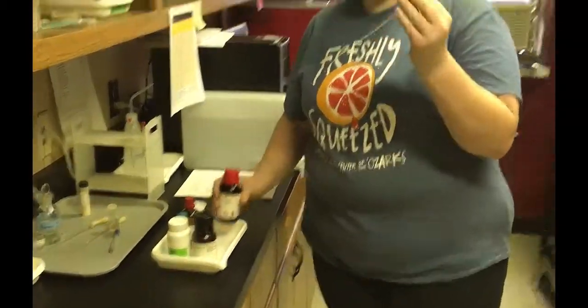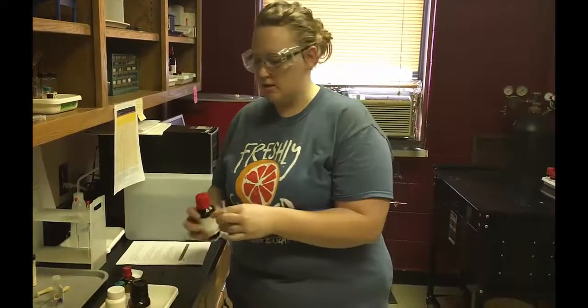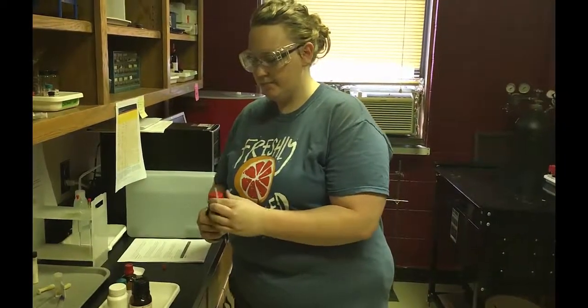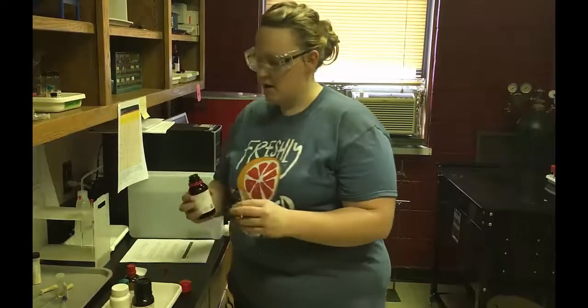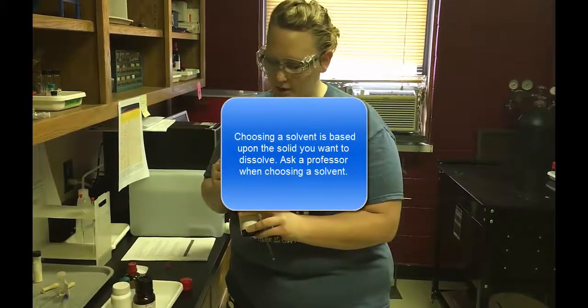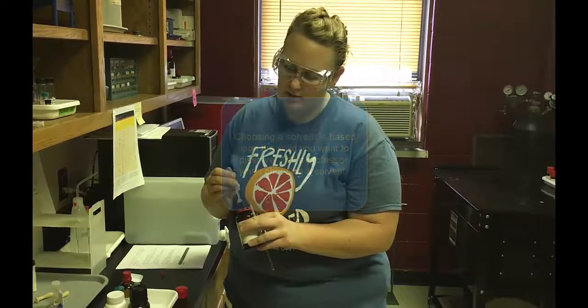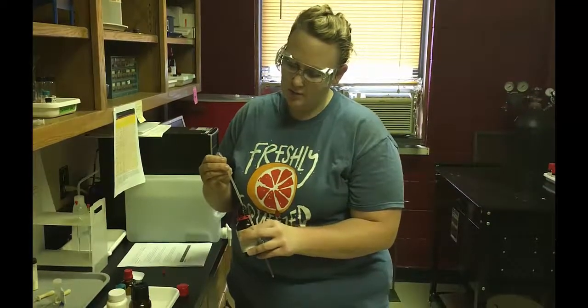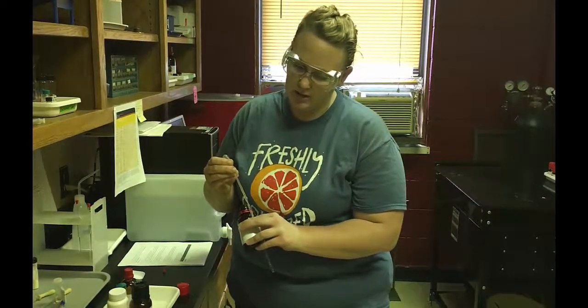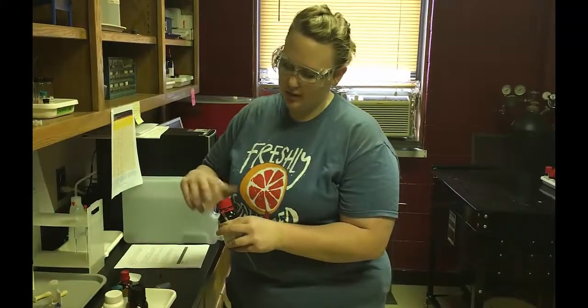Since this is a solid, the NMR machine will not run spectra on solids. It needs to be a liquid or solution. So I'm going to take a little bit of deuterated chloroform, because this will dissolve vanillin. You're going to take about 0.7 milliliters of chloroform and put it into the NMR tube. You need about this much liquid.